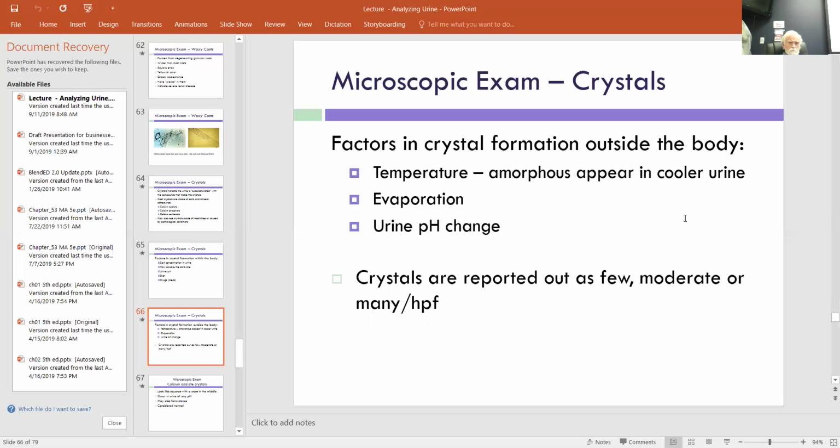You have a question, Maddie? So when we bring the sample up to room temperature, would you switch the sample around before actually using it? Well, I would. Okay, so that would make sense to me. Yeah, I would, but not shake it, just sort of swirl it a bit to encourage things to dissolve. Yeah, it would raise things from the bottom.